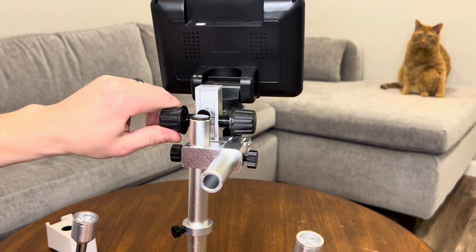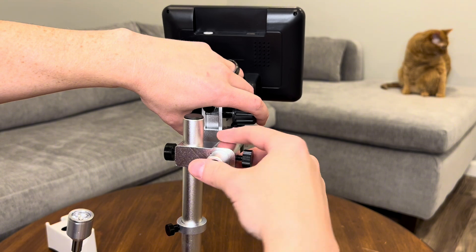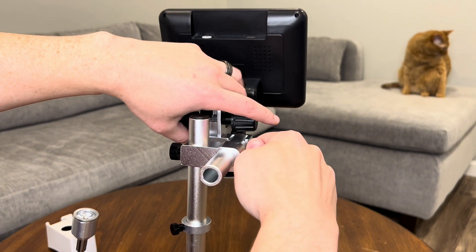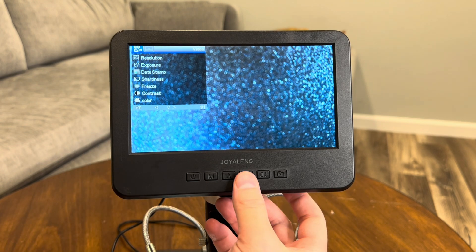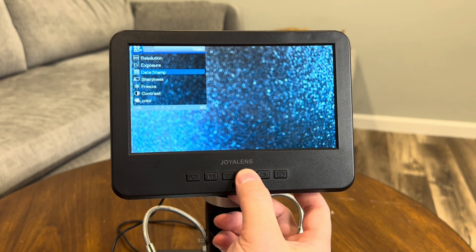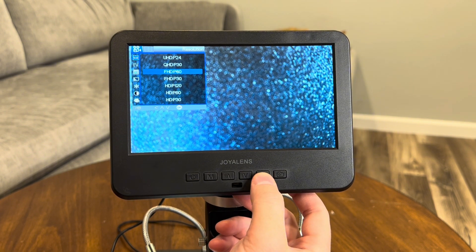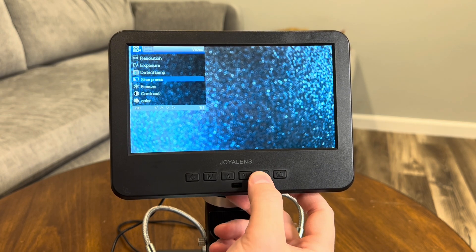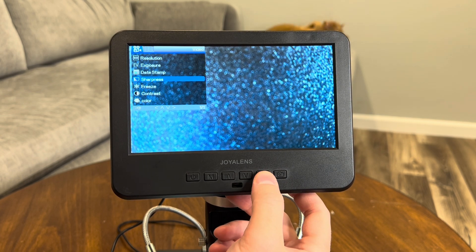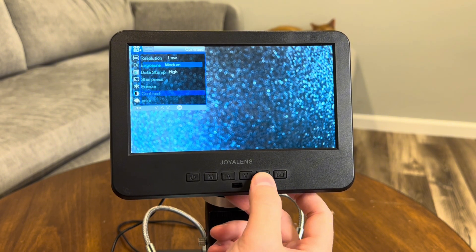The adjustable stand is another highlight. You can raise or lower the microscope to fit whatever you're working on, which is especially useful for larger objects like circuit boards or even small mechanical parts. The user interface is really intuitive — you can quickly adjust your zoom and control the settings for capturing photos and videos from the screen. It's designed to be user-friendly, so whether you're a beginner or experienced with microscopes, setting up is straightforward, and the features make it super versatile for a variety of uses from education to hobby work or even professional applications.